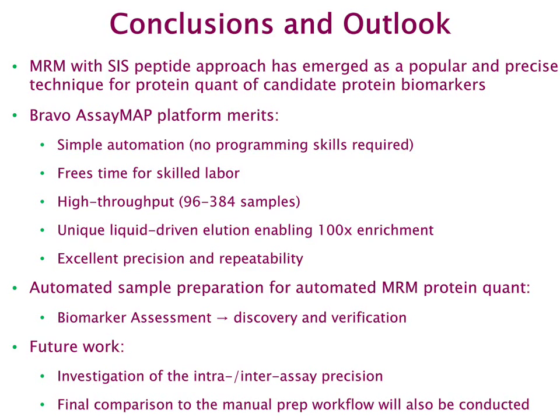Finally, since you can load up to 1 milliliter onto the cartridge, you can theoretically obtain an enrichment factor of 100-fold, provided that the loading capacity of 150 micrograms of the cartridge is not exceeded.